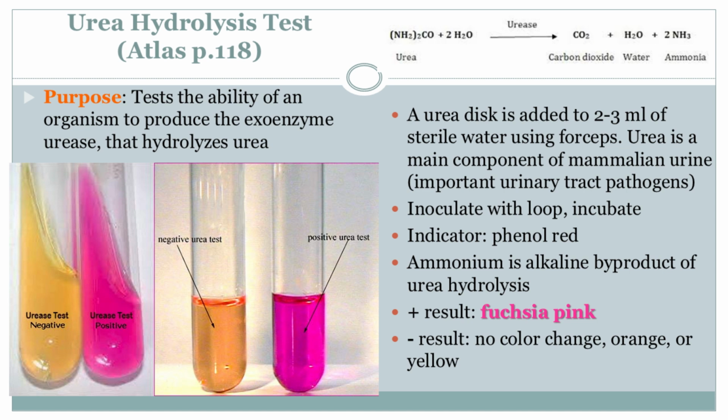Exactly. Some antibiotics work better on certain types of bacteria than others. So this simple test can actually lead to faster recovery for a patient. That's the goal. It's about getting people the right treatment as quickly as possible. It's amazing how something that seems so small, this color change in a test tube, can have such a big impact. And it doesn't stop there.